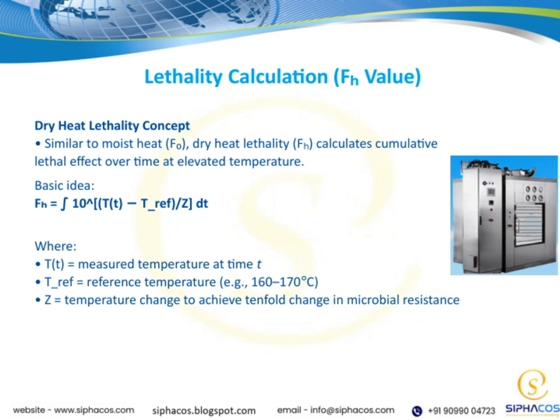to temperature shifts. By understanding and calculating FH, we can accurately assess how effective a dry heat sterilization process is over time. This approach helps us ensure safety and efficacy, tying back into the overall goal of our sterilization methods, reliably eliminating microbes through controlled heat exposure.